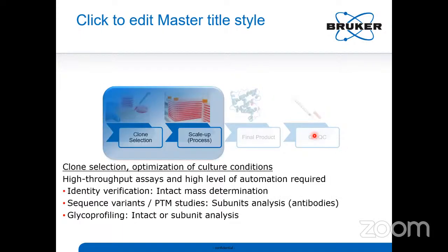From clone selection to scale up, final product, QC, QA documentation, everywhere our mass spec is required to confirm that particular protein sample. For example, in clone selection and scale up, we need it to identify the mass, to check any modifications happening in that particular mass, and glycan profiling. We have to check at subunit level. For that we need mass spec.